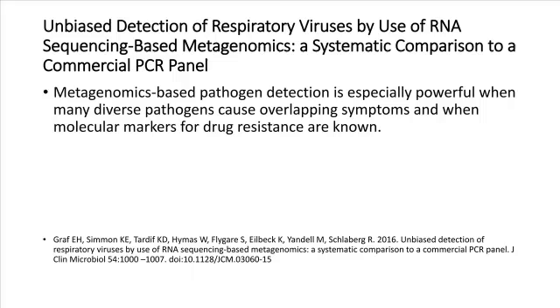Again, just a further validation of the power of metagenomic sequencing and identifying many diverse pathogens, overlapping system symptoms, and then also, as has been alluded to, identification of antibiotic resistance genes.